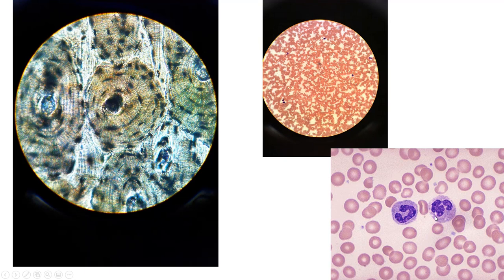Come over here. This is the blood. So this is just whole blood. All of these reddish-orangish cells in the background are red blood cells, or erythrocytes. The purple dots would be the white blood cells. We zoom in, you get a better picture. All of these are erythrocytes. These are white blood cells known as leukocytes. And then these tiny little specks like this and like this, these are the platelets, or thrombocytes.